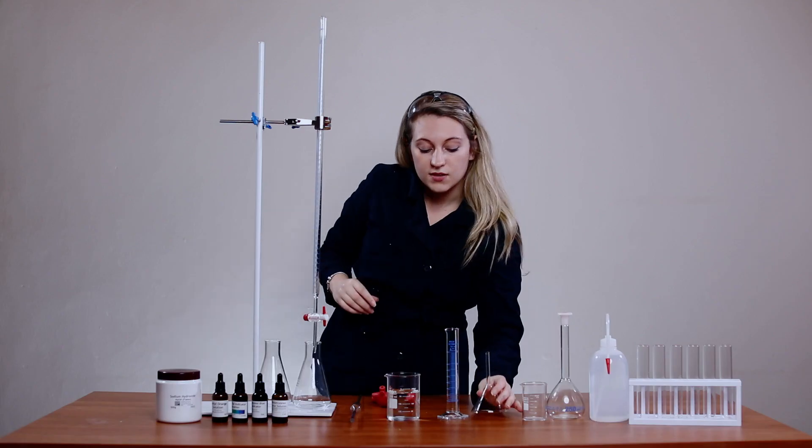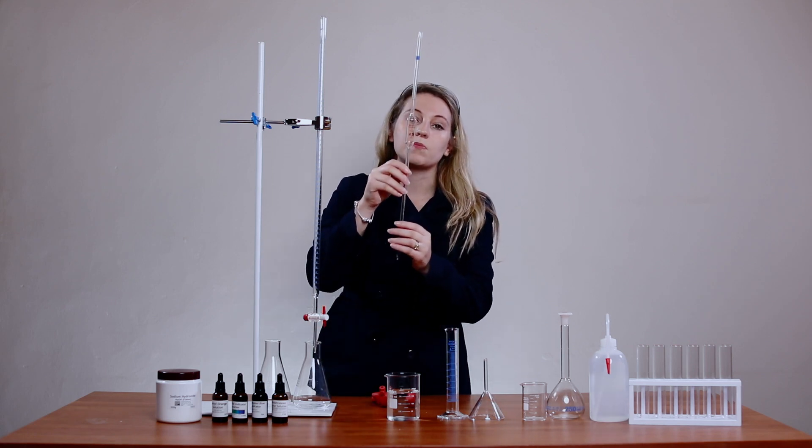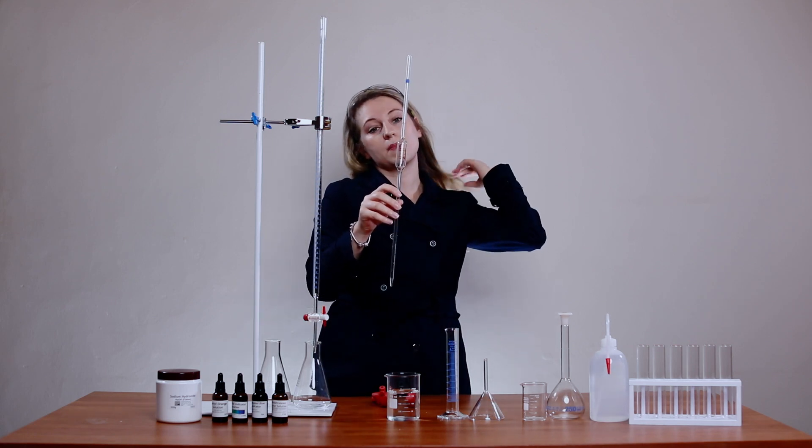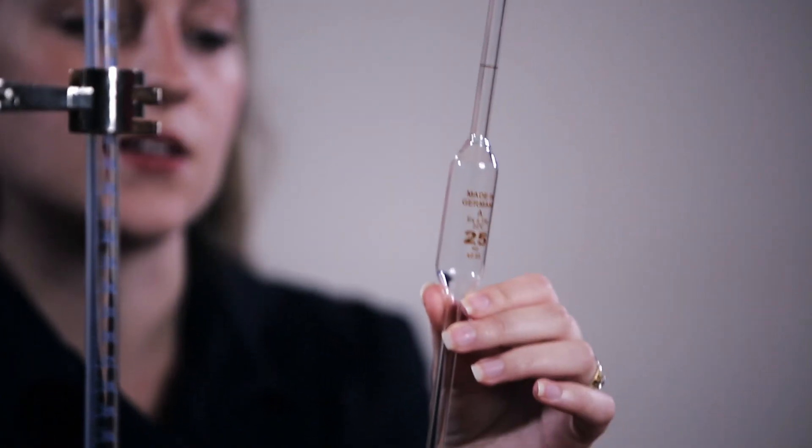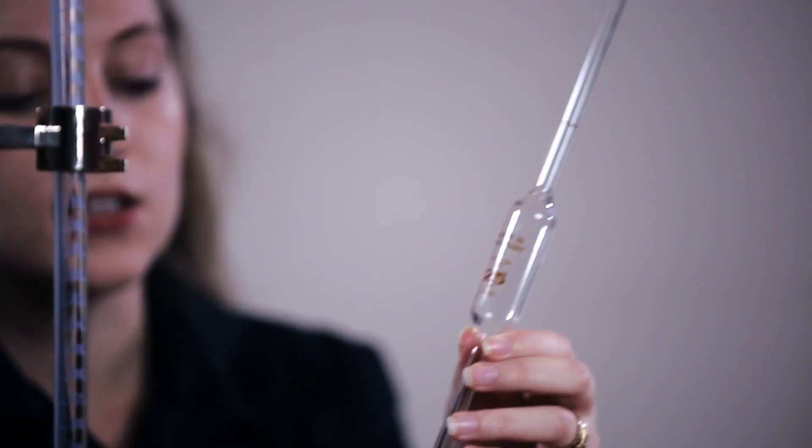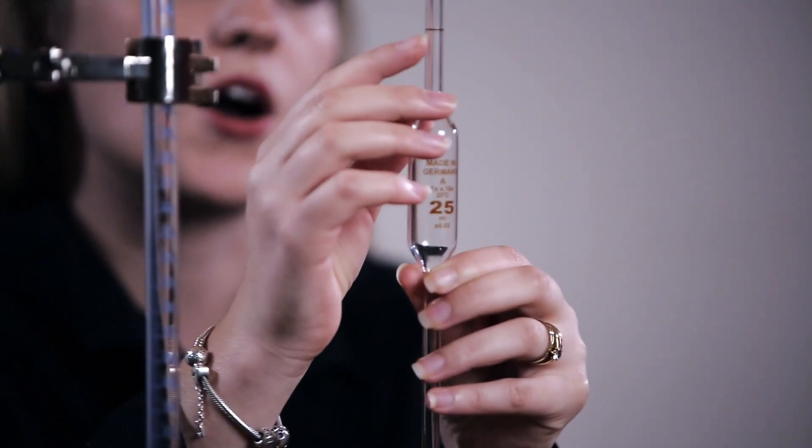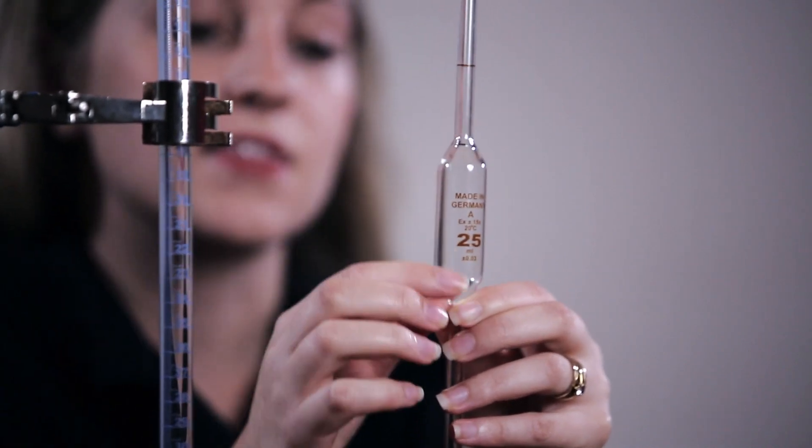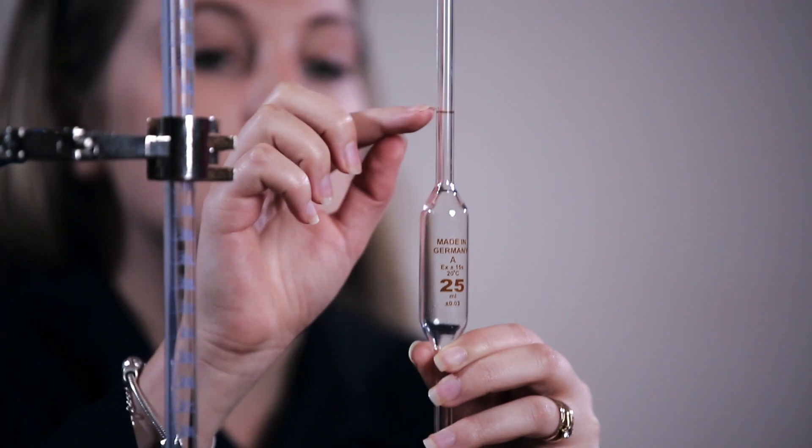Another essential element of a titration is a pipette. This one is a 25 milliliter pipette and if you look very closely you can see there's a small brown marking on the glass and this is up until where you will suck the liquid until the meniscus is just above that mark.